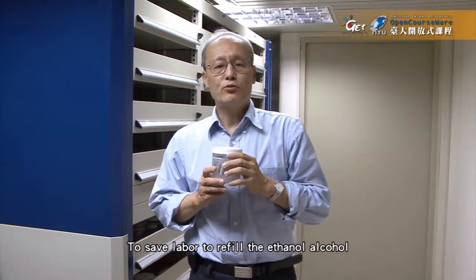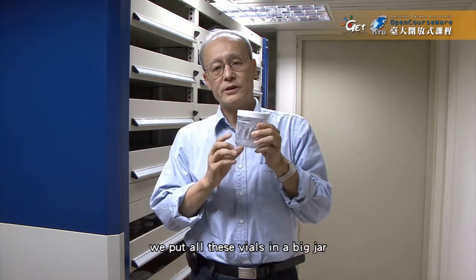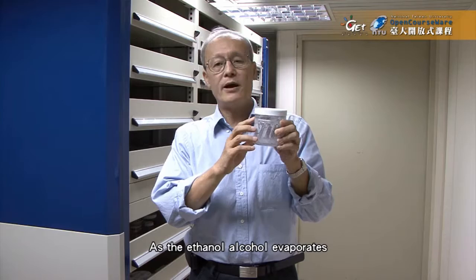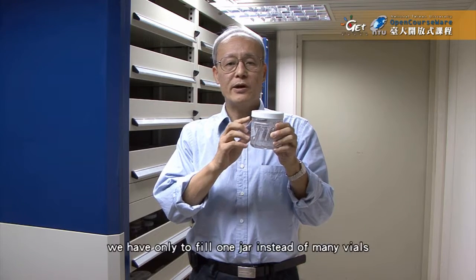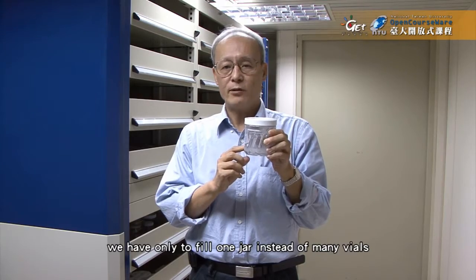To save labor to refill the ethanol alcohol, we put all these vials in a big jar, and as the ethanol alcohol evaporates, we have only to fill one jar instead of many vials.